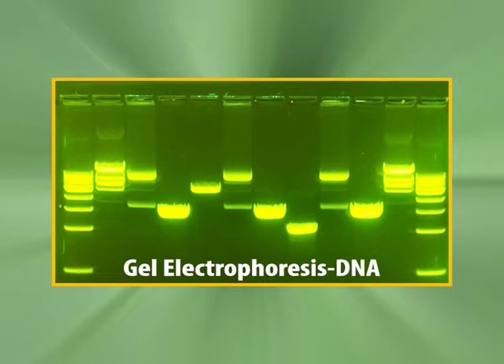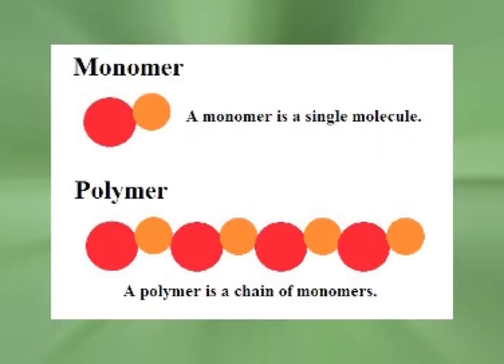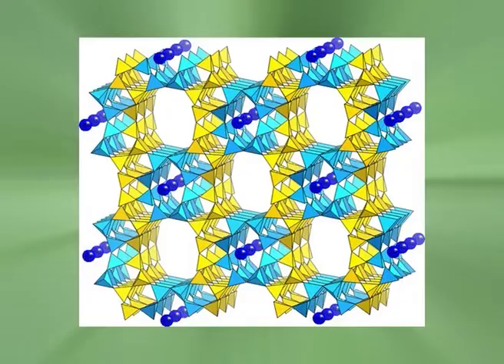This is possible because the gel enhances the friction that governs the electrophoretic mobility. Low concentrations of matrix material or a low degree of cross-linking of the monomers in polymerized gel systems allow them to be used largely as a stabilizing or anti-convection device with relatively low frictional resistance to the migration of macromolecules. Alternatively, higher concentrations of matrix material or a higher degree of cross-linking of monomers are used to generate greater friction, which results in molecular sieving.